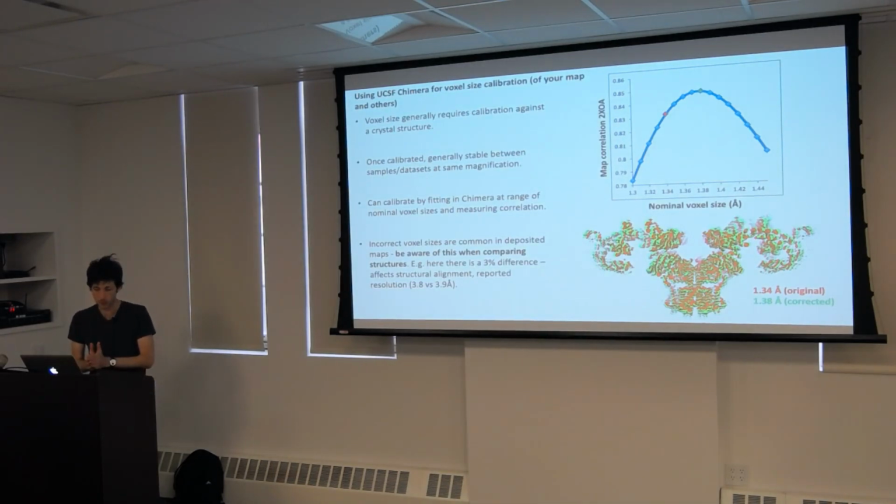The other point that I would make that's specific to EM, which we don't encounter in X-ray, is that we often don't know exactly what magnification we're working at. The nominal magnification that you collect your data at may not be right, depending on what microscope you're collecting on, and I definitely would assume that it's wrong unless, I mean, here at SEMC everything's being calibrated.